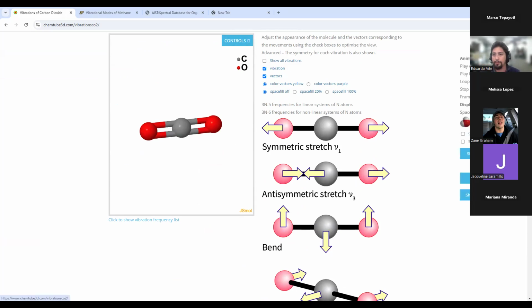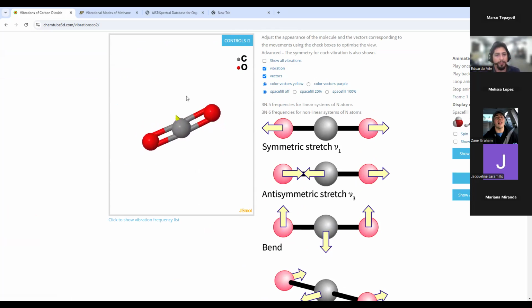Here's an example of the carbon dioxide bending. You can see in this one the carbon bends down and the oxygens stay in the plane. Here you see another one, also in the y-axis plane. Here's another where the two bonds of the carbon dioxide move away from each other; this is more like the spring-like motion. Here's another example. This one is more asymmetrical, so it waves and wiggles in and out. All of these absorb energy and show up as peaks. But only the asymmetric ones for this specific molecule will actually show up, because that is disturbing the dipole moment.